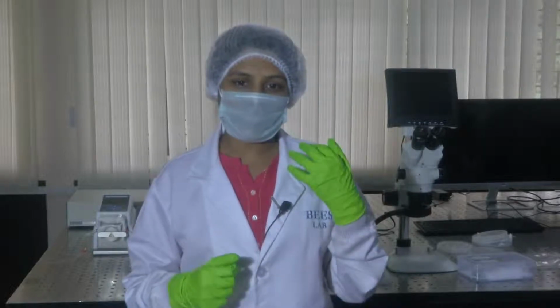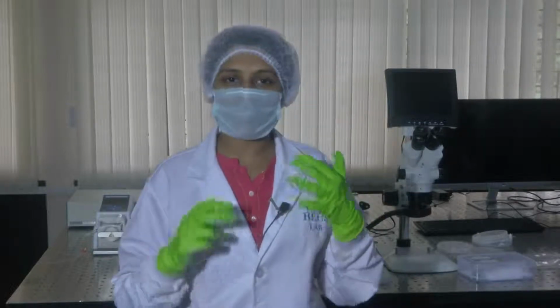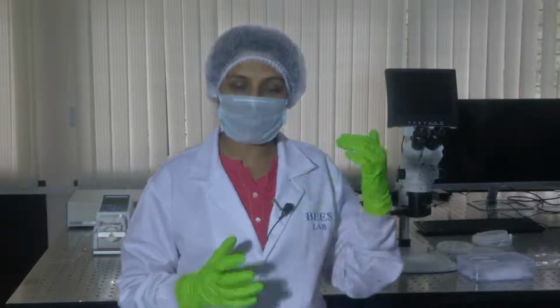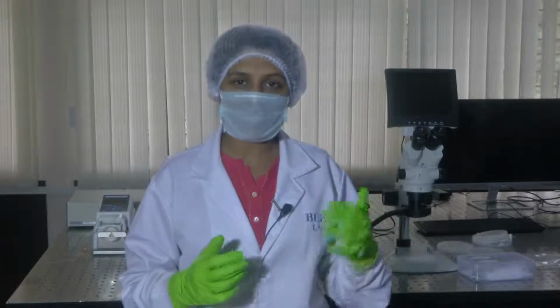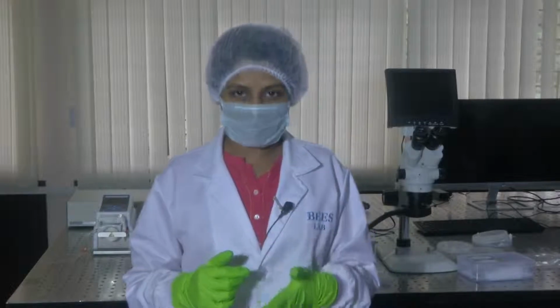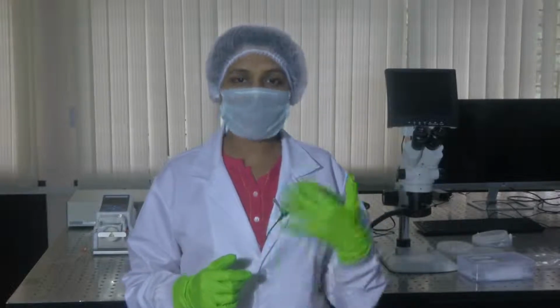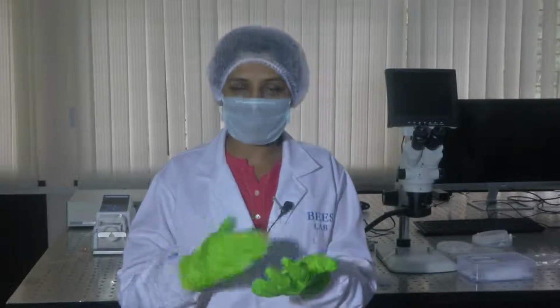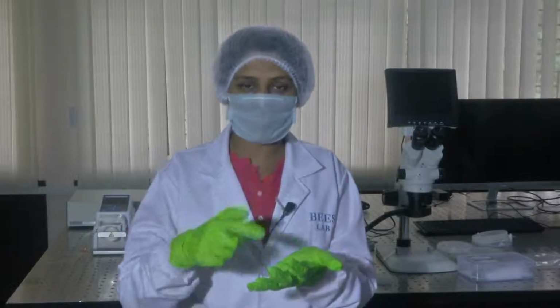The well-known driving mechanisms of pumping in microfluidic devices or biochips mostly used are the syringe pumps and the peristaltic pumps. But today we would be studying more about peristaltic pumps and how they are used in driving fluids through the channels which are engraved in your device.